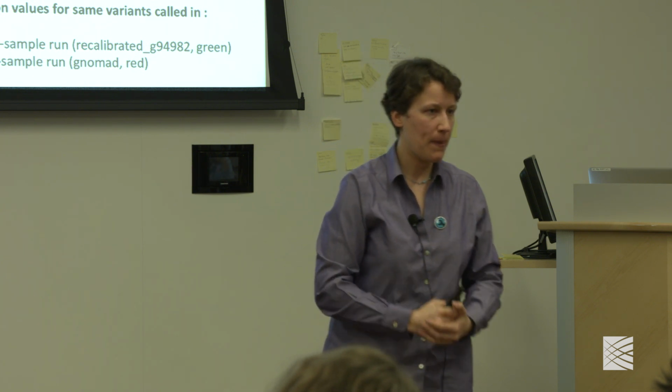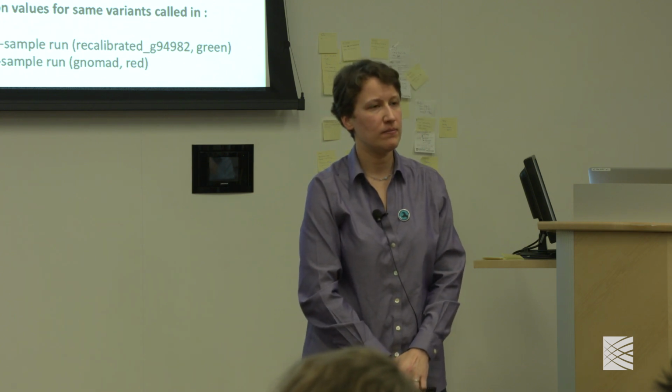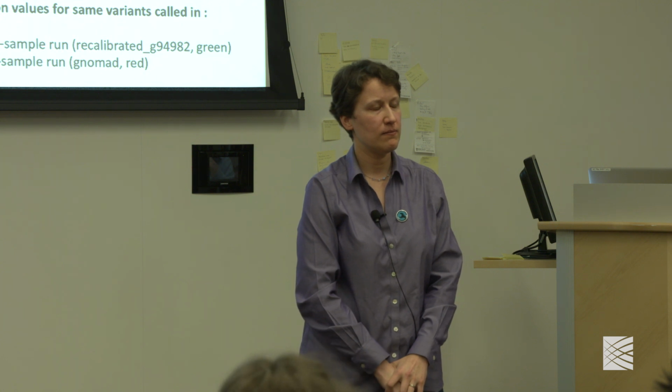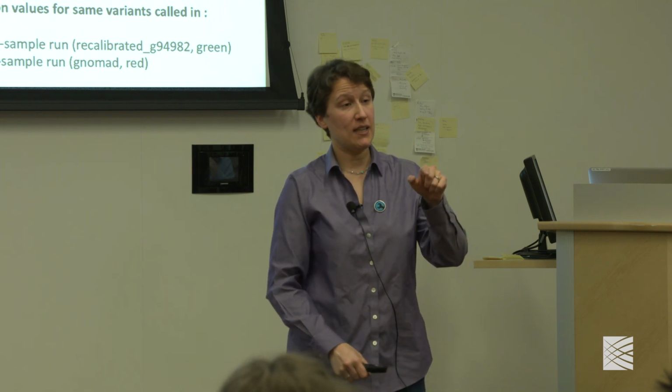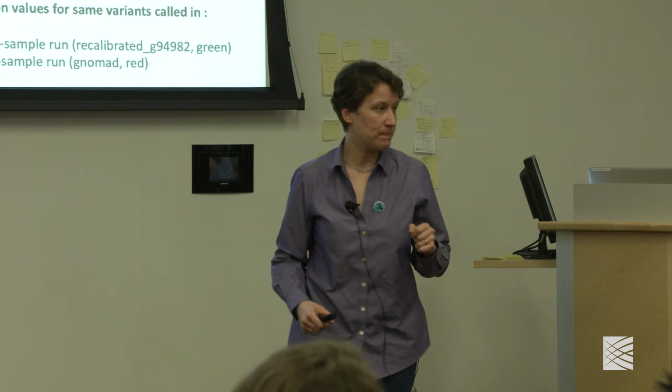That's right. From what I understand, the separation, so the fact that there are 2 modes in the red distribution, is not separating the noise and the signal in that case, right? So you still have to look on the middle left side. It's a lot more separated if you think about it. It's hard to say. I mean, we don't have any information about these variants in this plot.